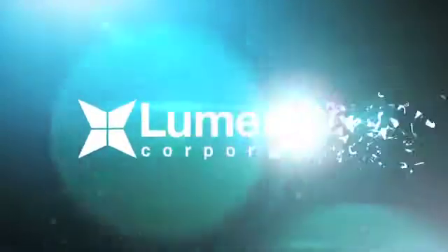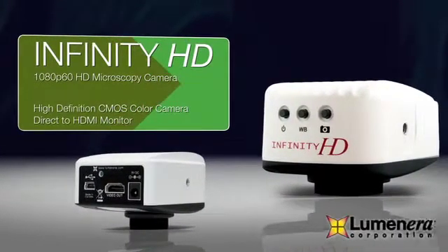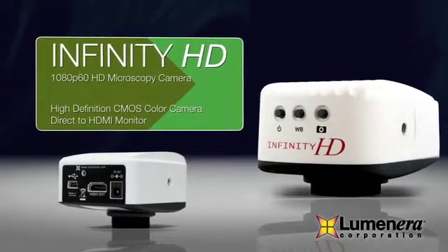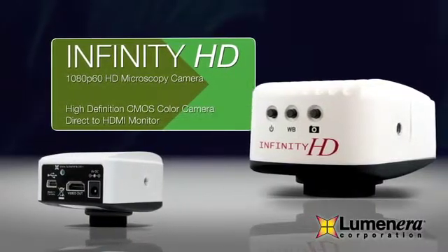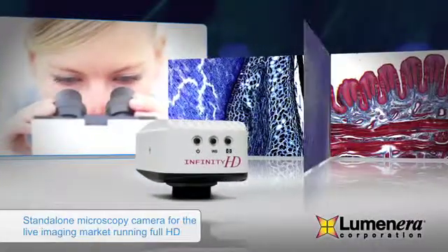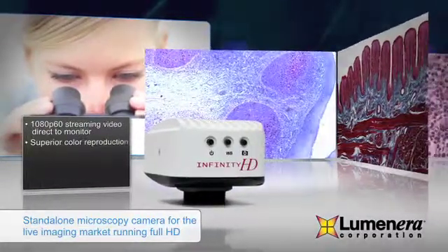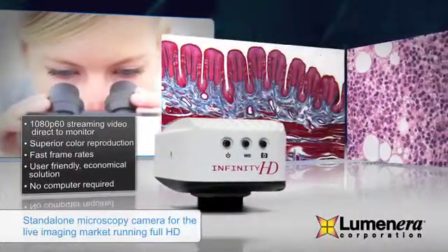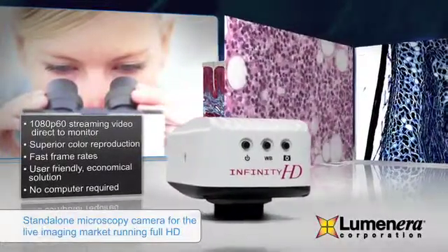Lumenera, the global market leader for high-quality, economical imaging solutions since 2002, is pleased to introduce the Infinity HD, a high-resolution 2.0 megapixel microscopy camera built to provide streaming video output over an HDMI connector direct to a monitor without the need for a computer. The Infinity HD microscopy camera offers full 1080p 60 streaming video with superb color reproduction with no lag. It has been designed as a complete economical scientific camera for live imaging and provides true high-definition video.